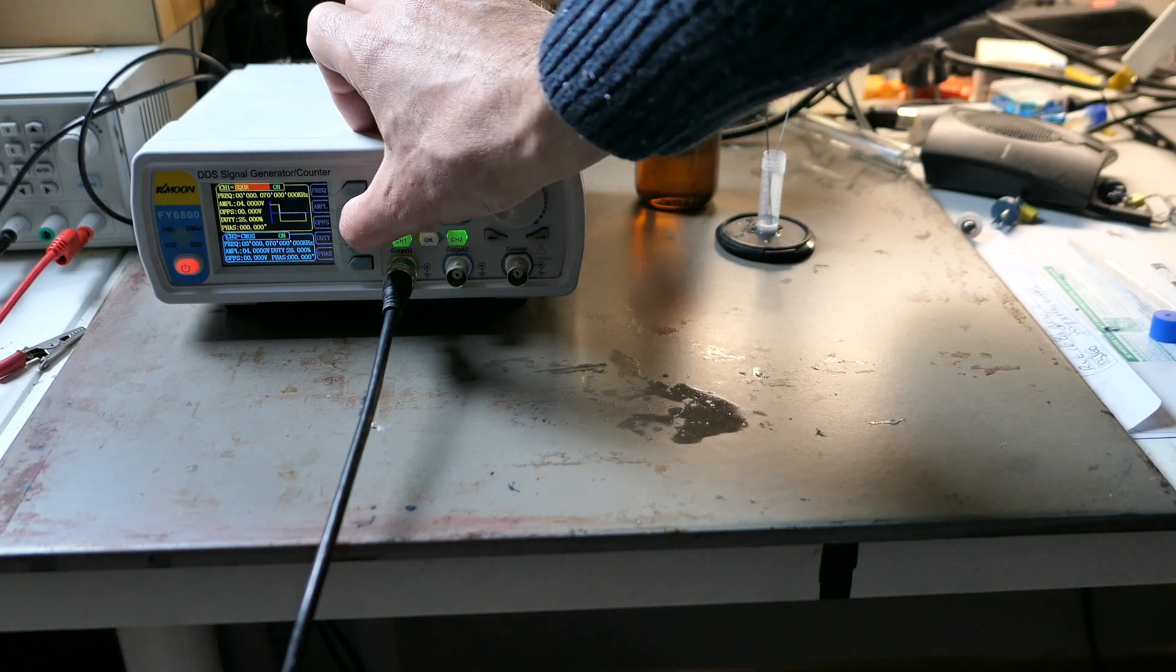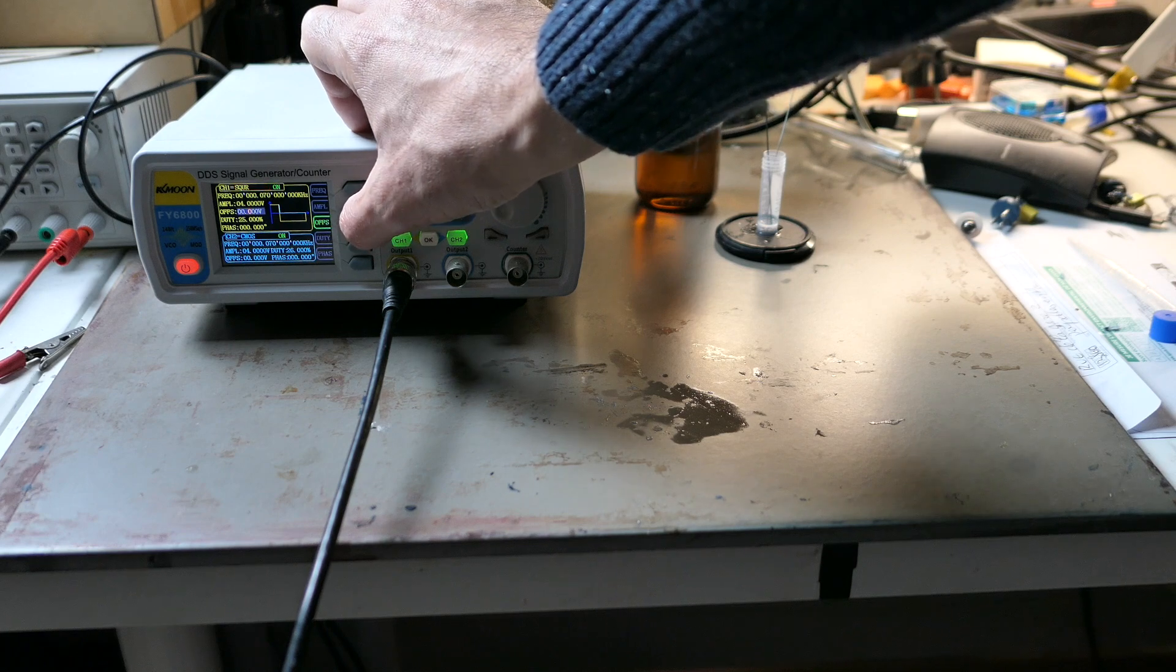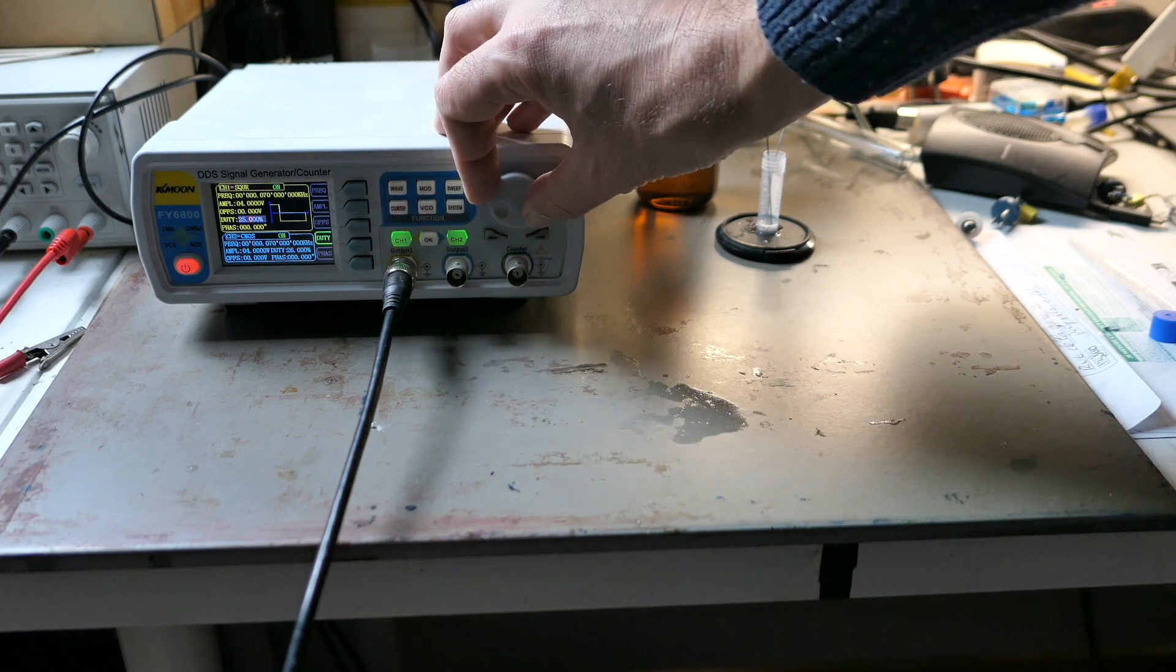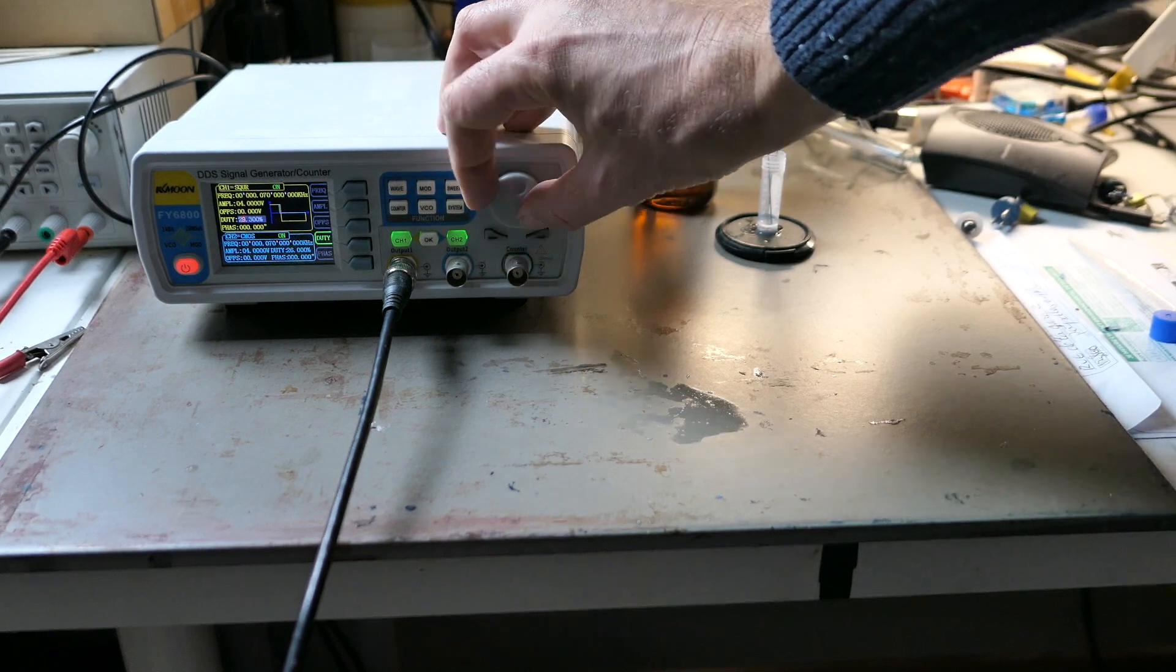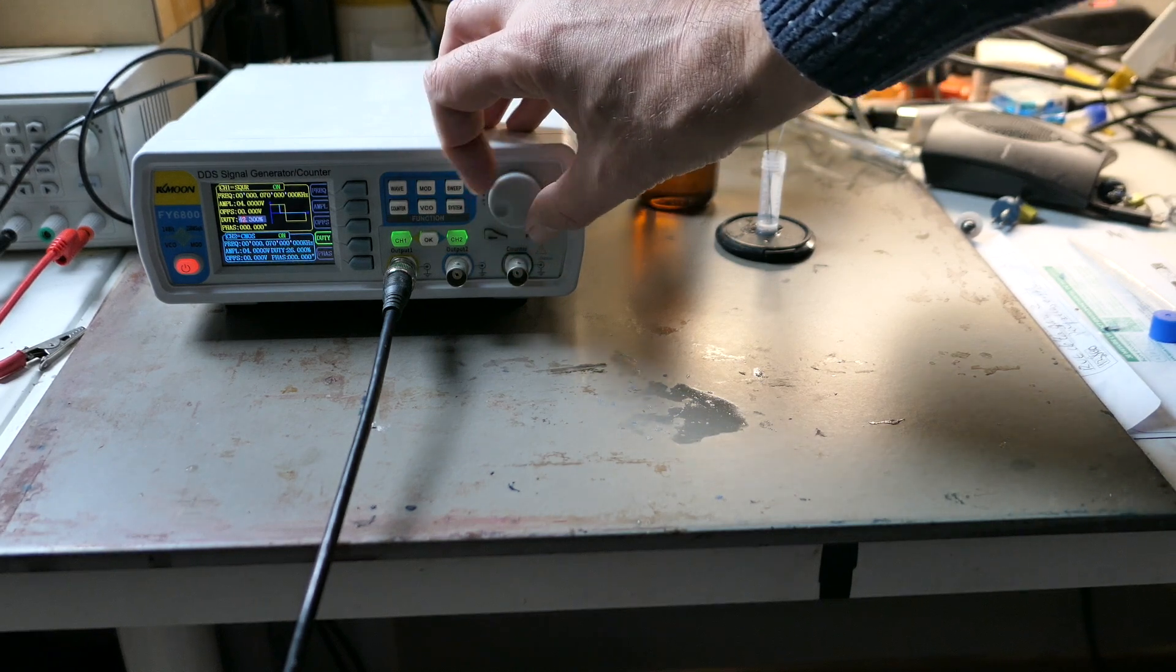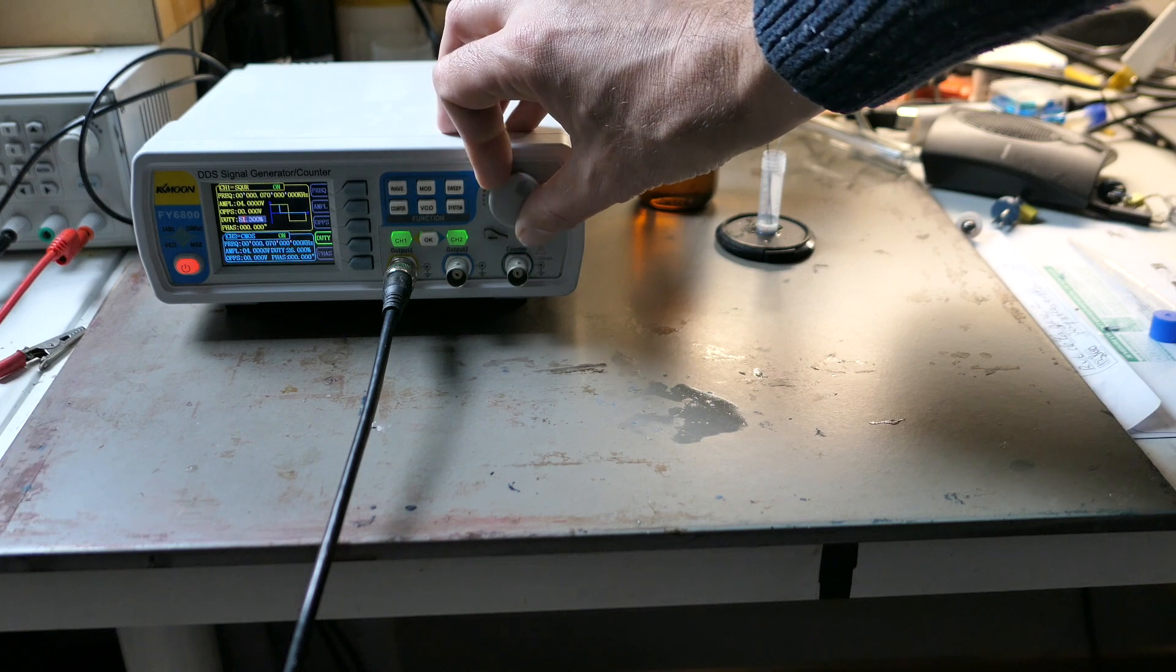However, these studies suggest that adding a small DC offset voltage to the signal can help the process. Now I'm setting up the entire system. The electrolysis will take place in a very small container.